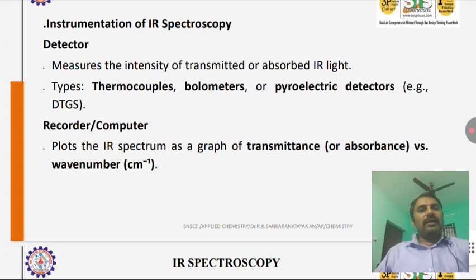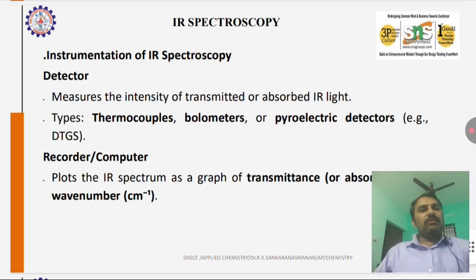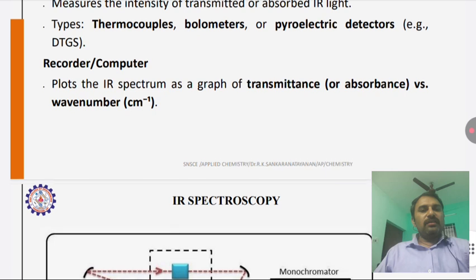And the detector, what will be the detector? Thermocouple, bolometers and pyroelectric detectors. These are the detectors. And for the recorder, generally we use a computer; we get the graph on the computer. That will be the recorder.